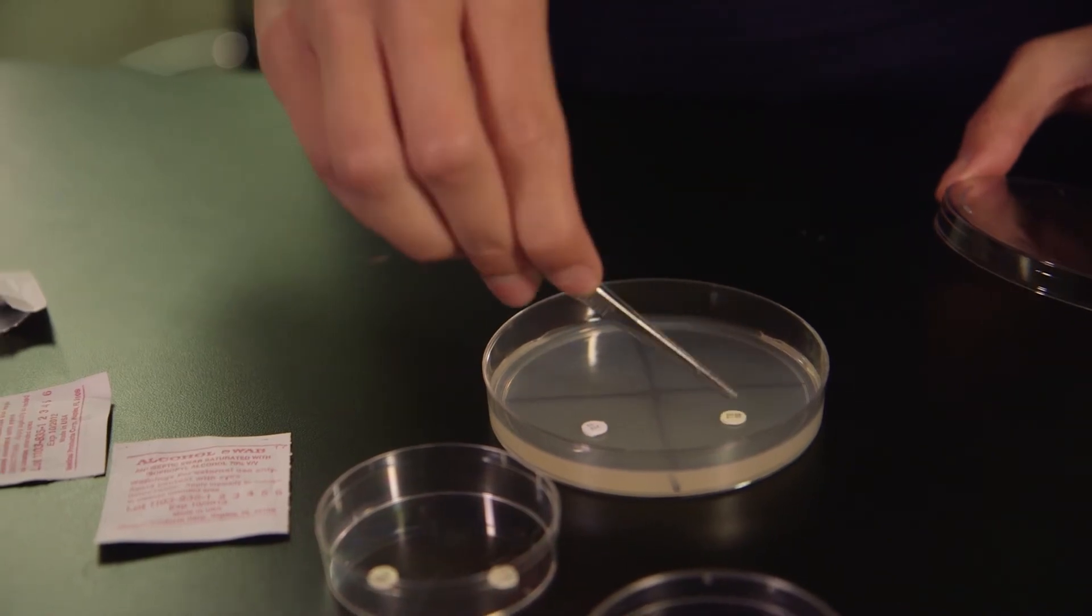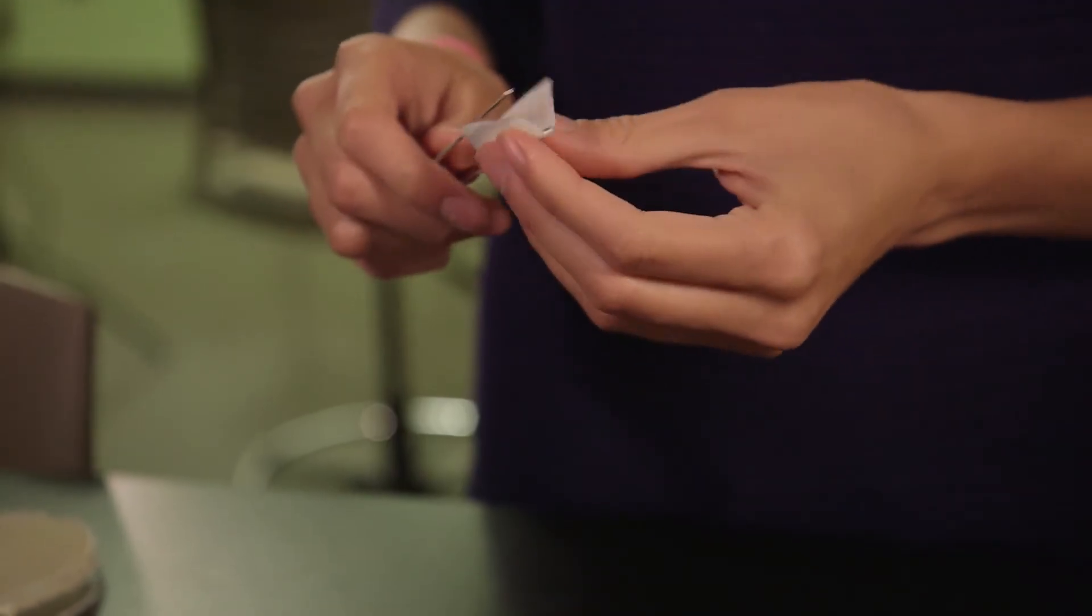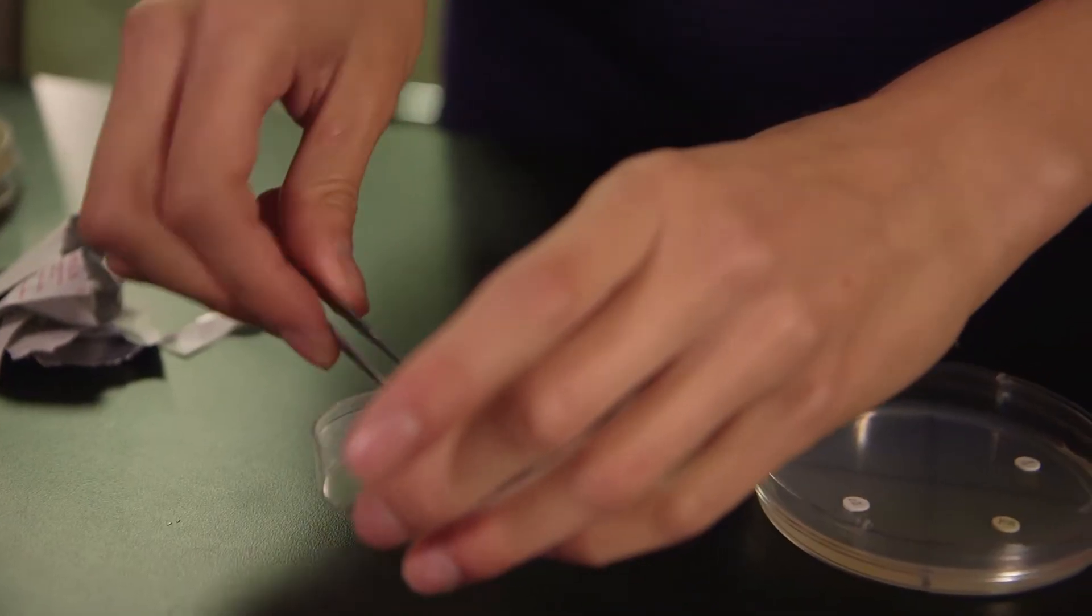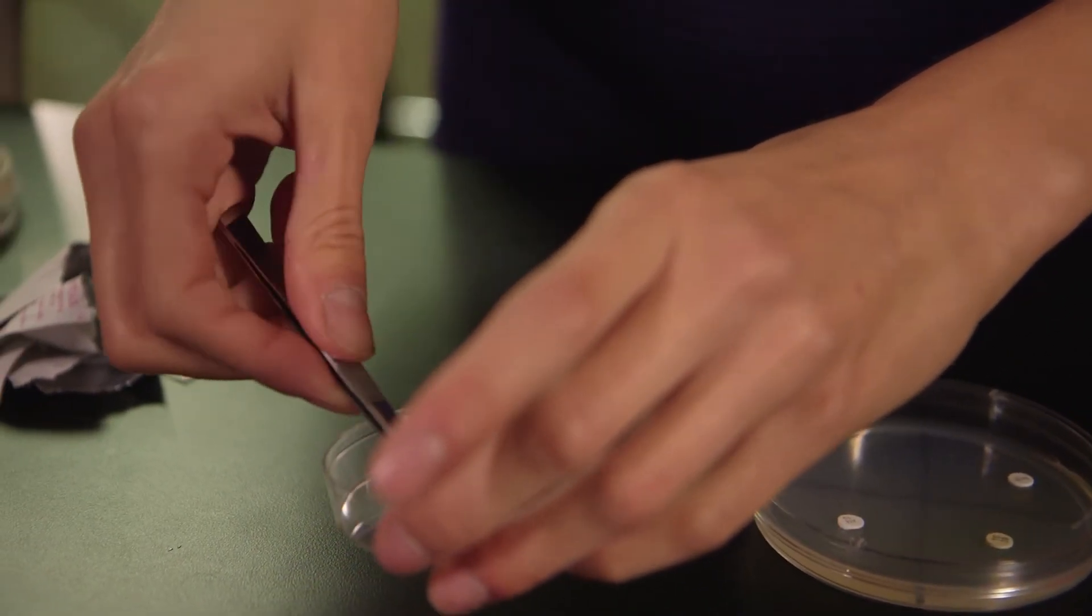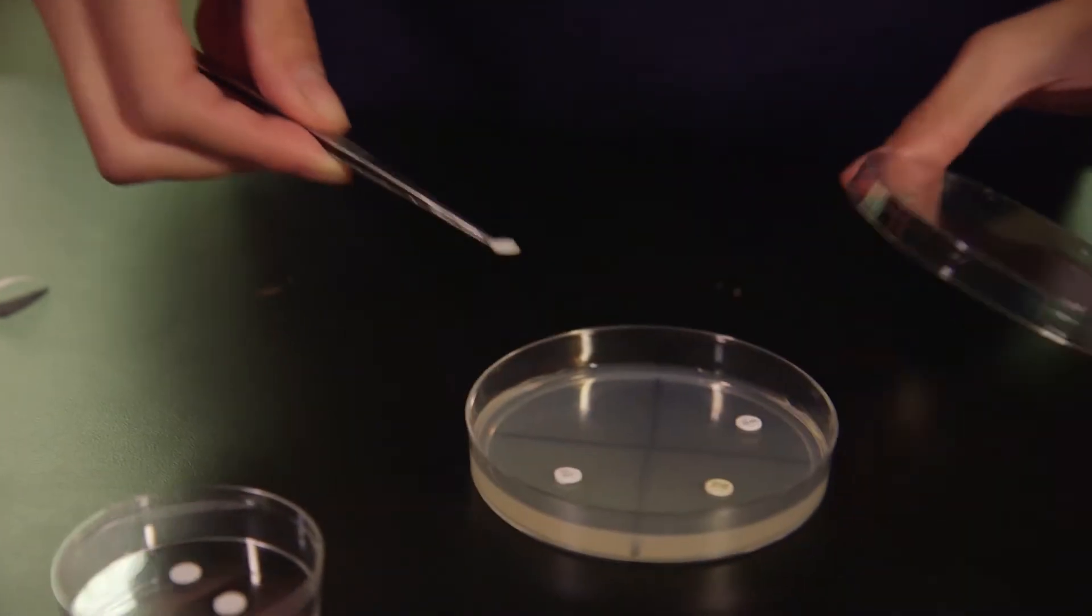Repeat the procedure for the other two antibiotics, sterilizing the forceps before you remove a disc each time. Finally, you will place one blank disc in the last quadrant, the same way you place an antibiotic disc.